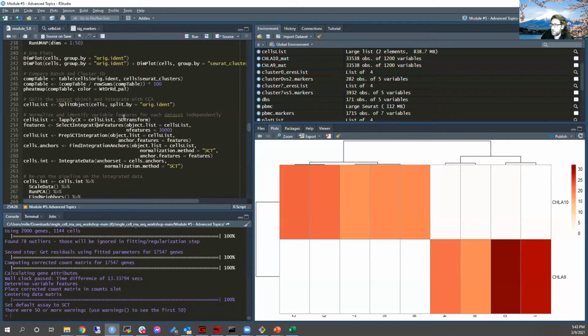All right, so we did the scTransform. Basically, this is a more robust transformation than the log2 and the scaling provides, right? I think I talked about this last time, but basically it uses the modeling method that we use for determining the mean variance trend and then regressing it away and then finding the true variable features and then applying the transformation to the data set. There's a bit more that goes into it, but that's kind of the underlying intuition behind how it's working. There's a fantastic paper they wrote all about it. And if you want to read it, I'll link it in the website for today. I'm happy to facilitate that.